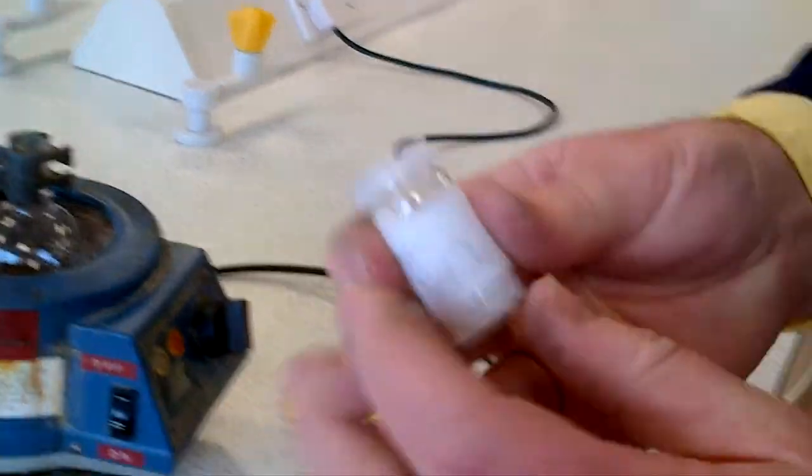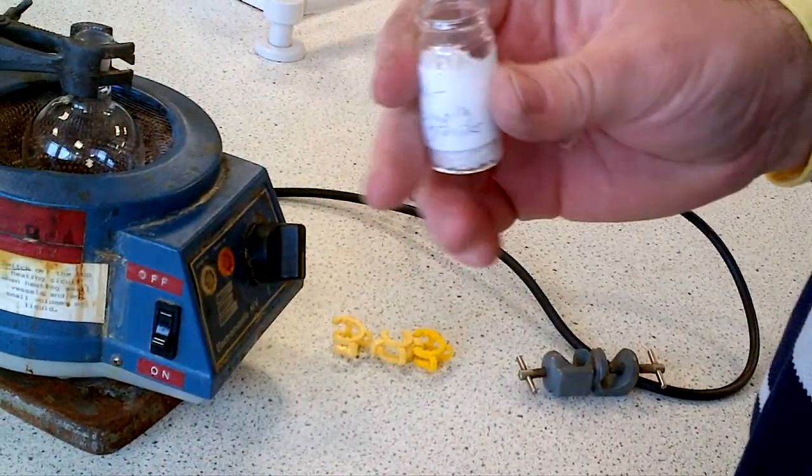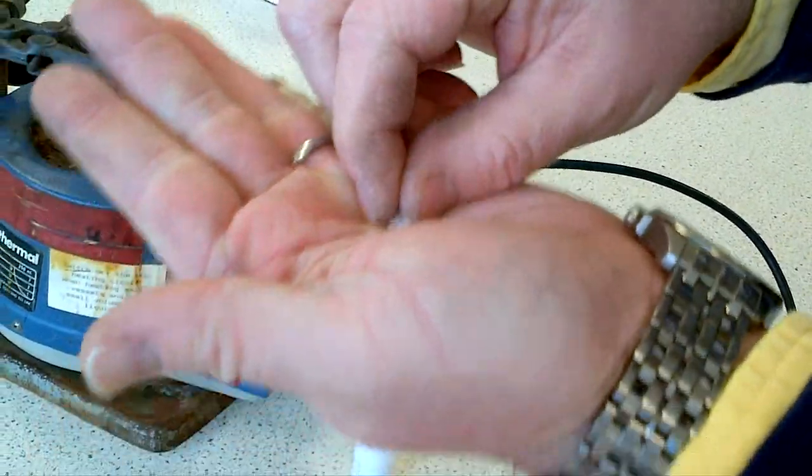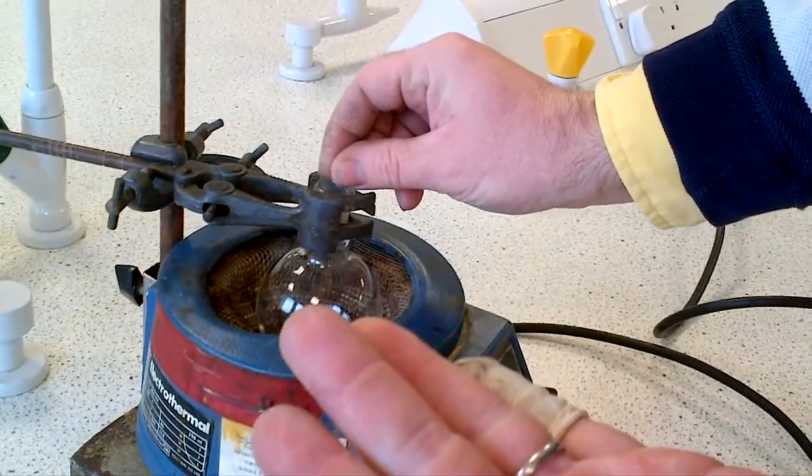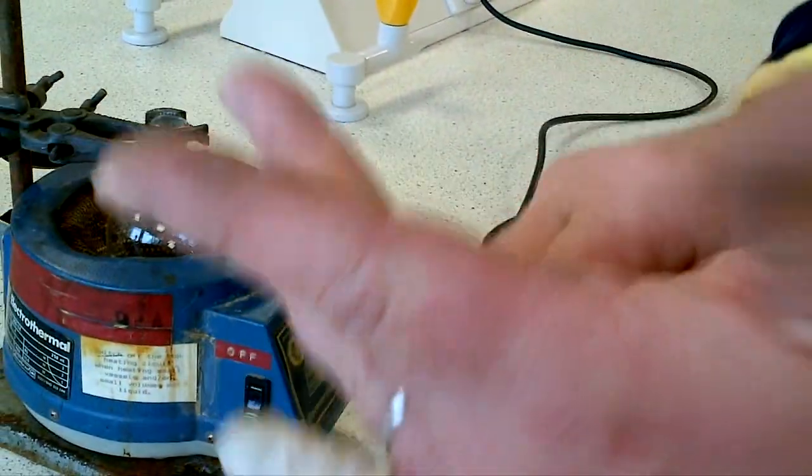At that point, it's best to get some anti-bumping granules, white or black. Black is probably better to visually spot. Take a couple of granules and throw them into the liquid. That'll stop the organic liquid from bumping up.